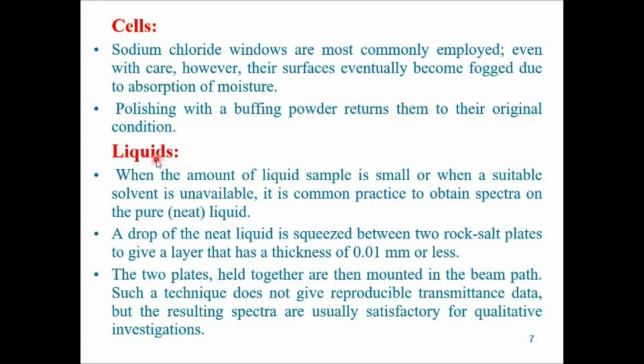Now, liquids. Till now we were looking at solutions. When the amount of liquid sample is small or when a suitable solvent is unavailable, it is common practice to obtain spectra on the pure or neat liquid. A drop of neat liquid is squeezed between two rock salt plates to give a layer that has a thickness of 0.01 millimeter or even less.